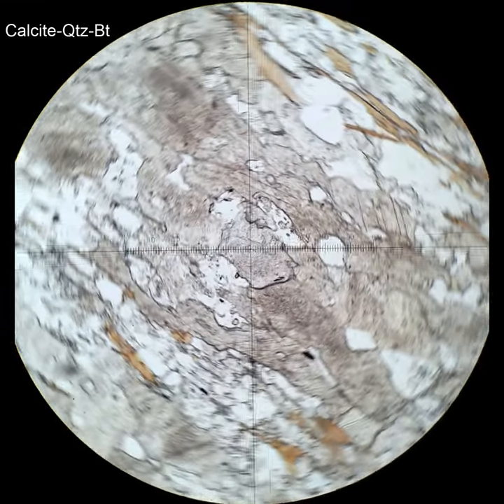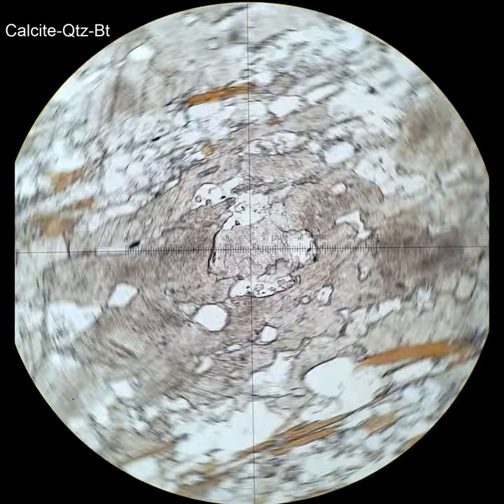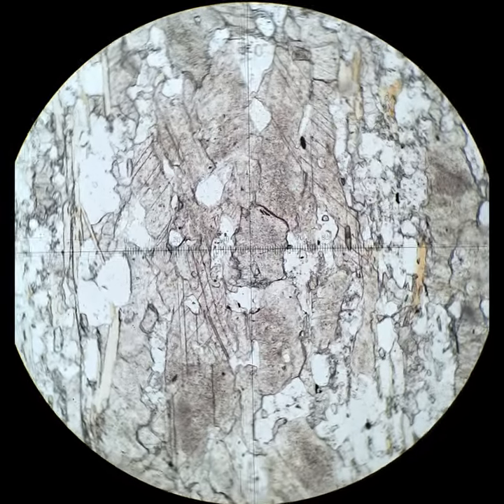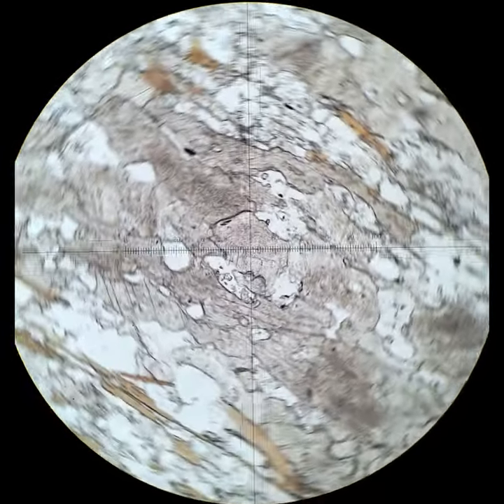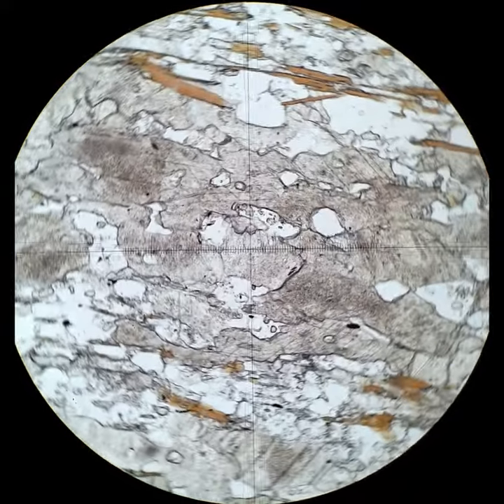This is what I was talking about with variable relief. That one grain in the middle — you'll notice it gets darker, like it's dark there, and it's lighter, and it's darker there. That's variable relief.